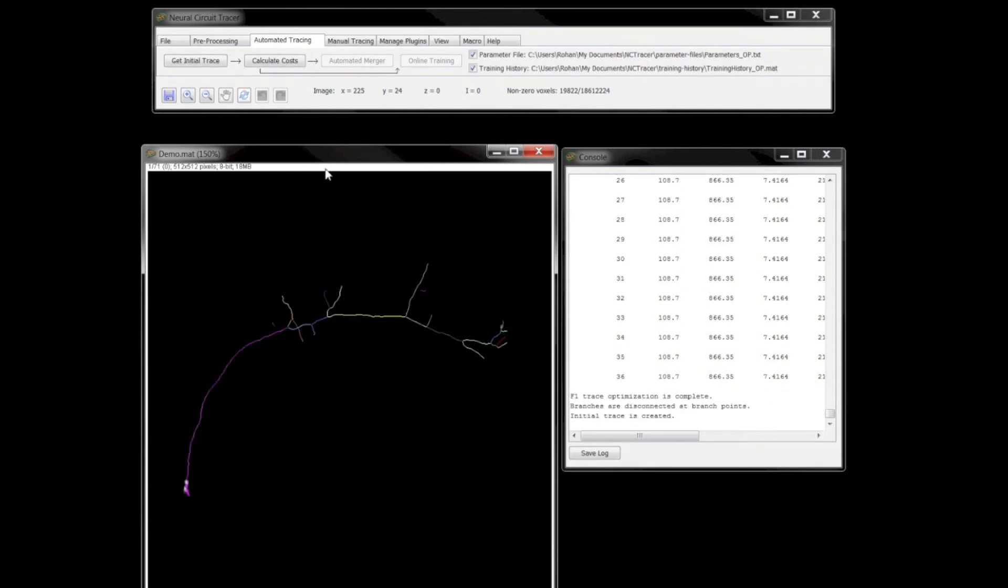A trace obtained manually or automatically can be used to train Neural Circuit Tracer's learning algorithm. Information about training Neural Circuit Tracer and saving the training data using the online training option will be the subject of another video.